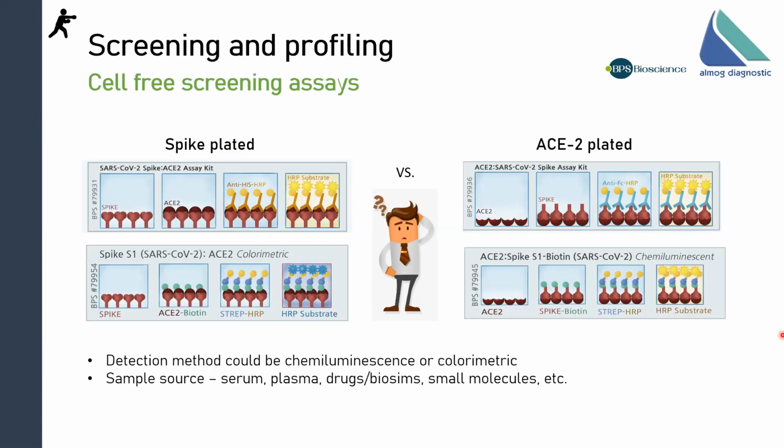Now, those two cell-free based detection methods can be either chemiluminescence or colorimetric, and your sample source can be serum, plasma, any drugs you wish to screen, or small molecules that you can design. So this is the cell-free screening assay.